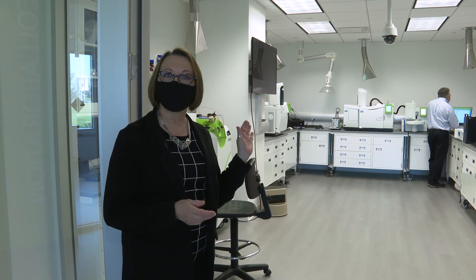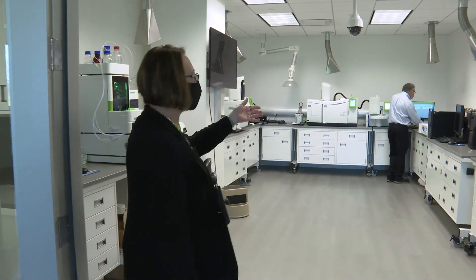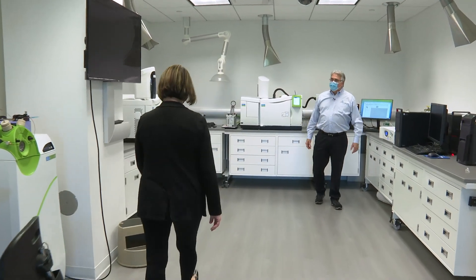Next we're going to stop in our chromatography lab. I'm going to start with our gas chromatography with Alan. Welcome to the GC lab.